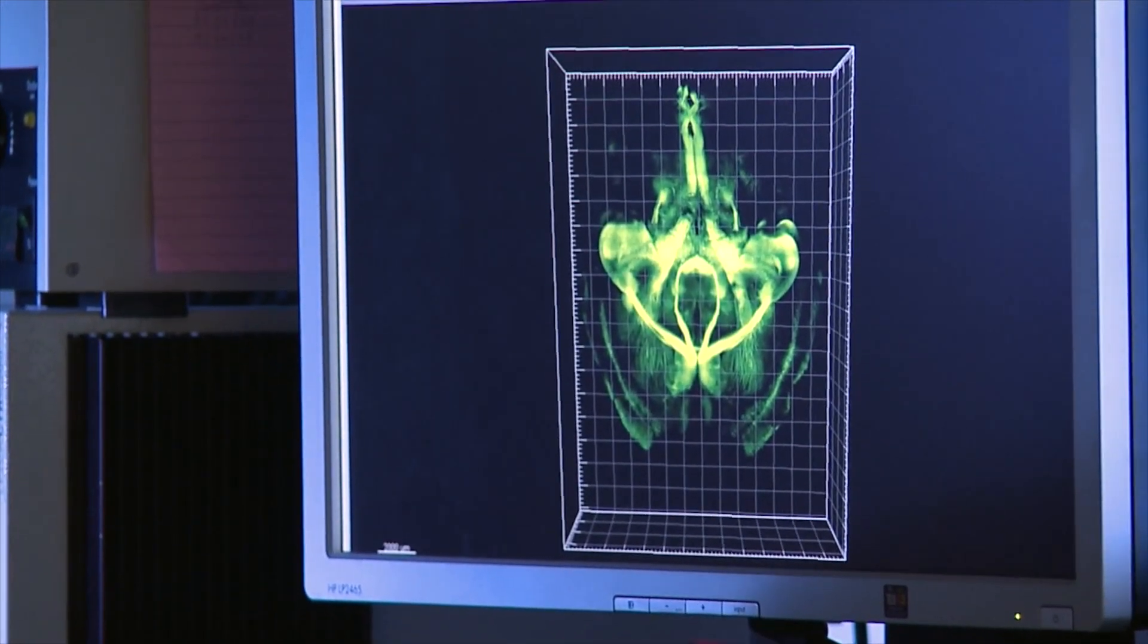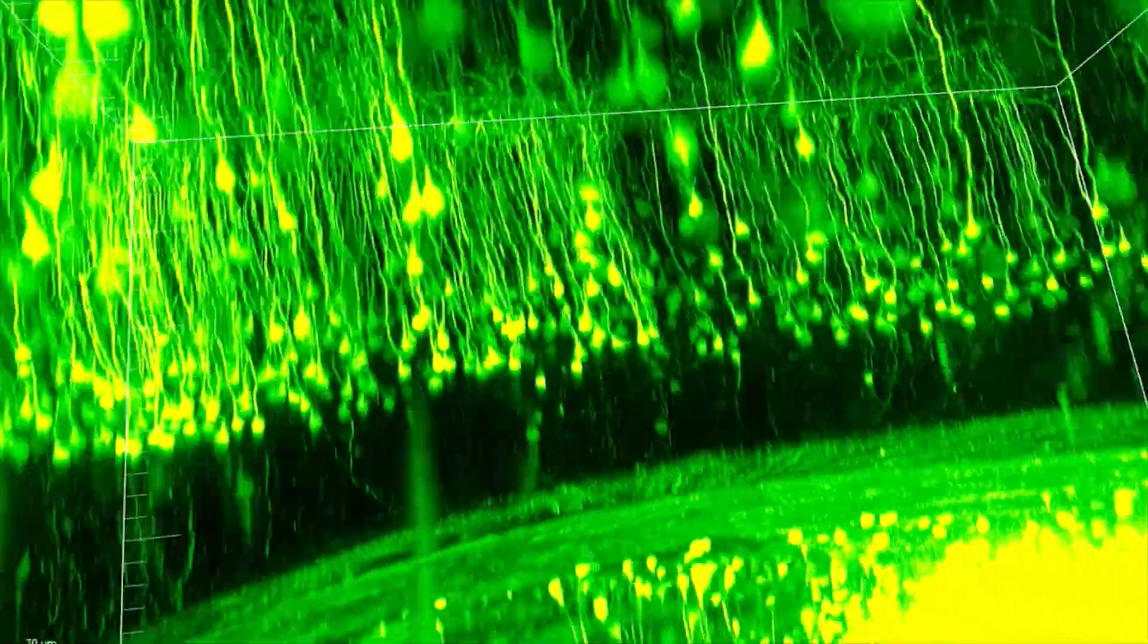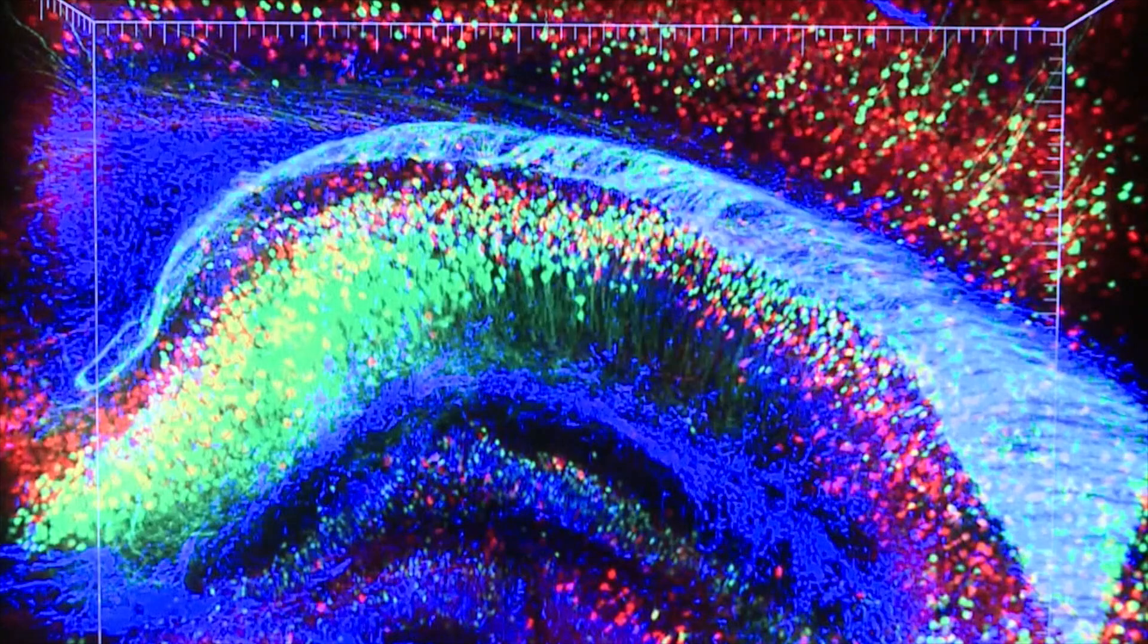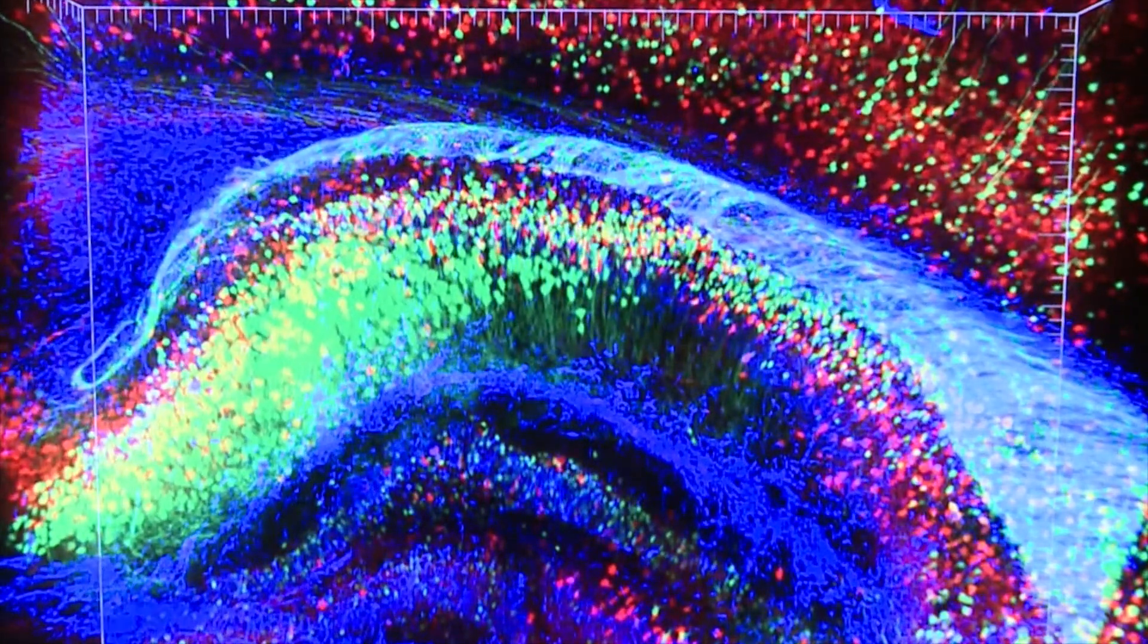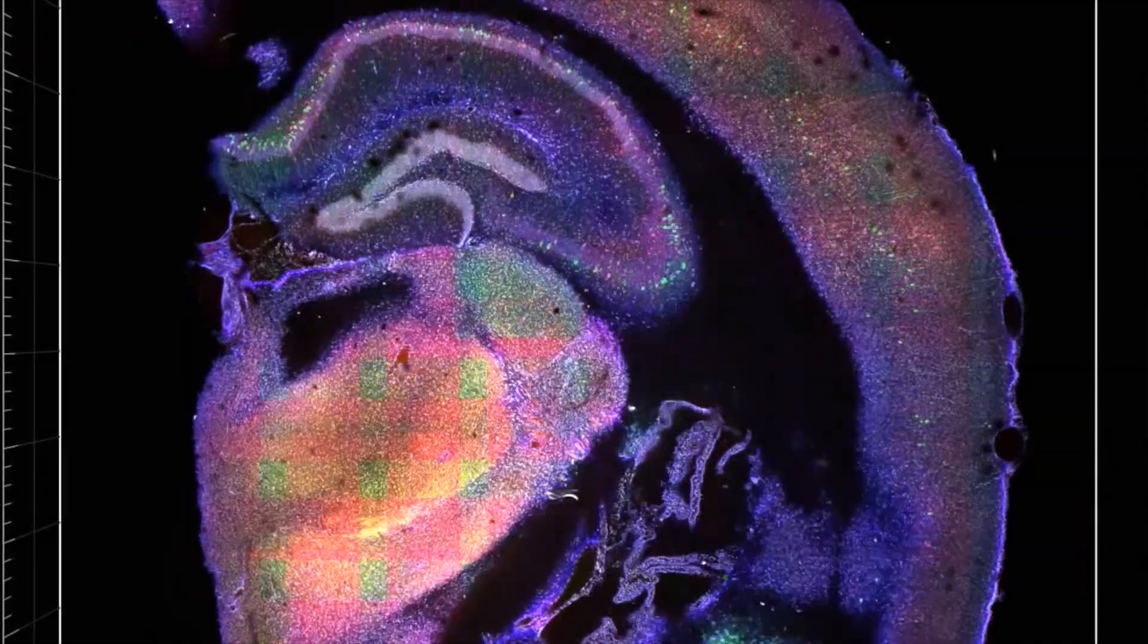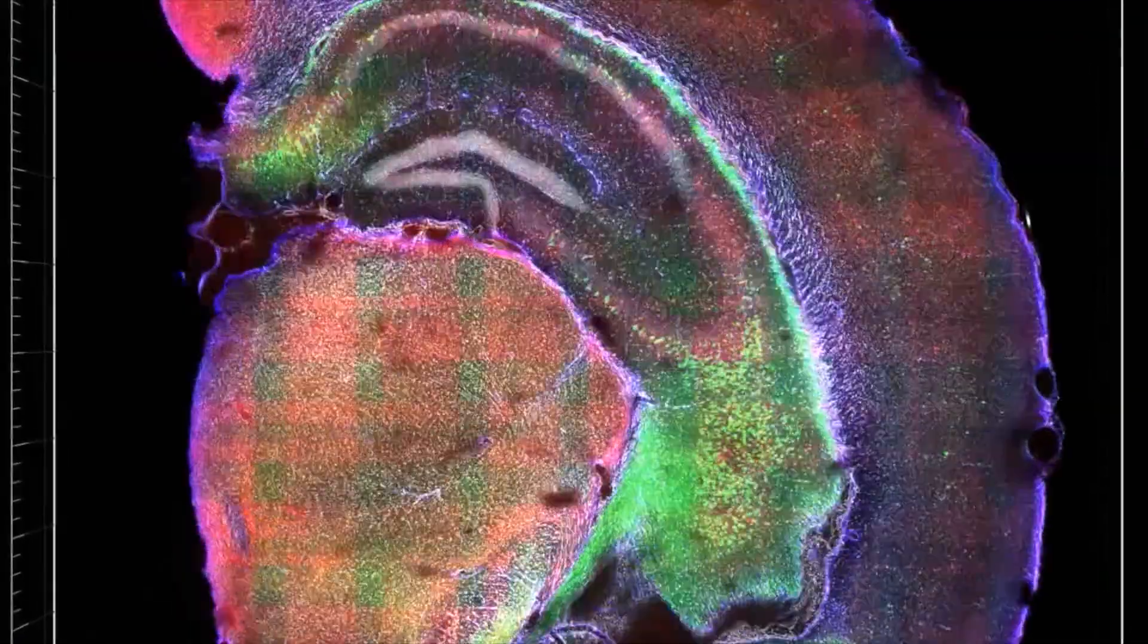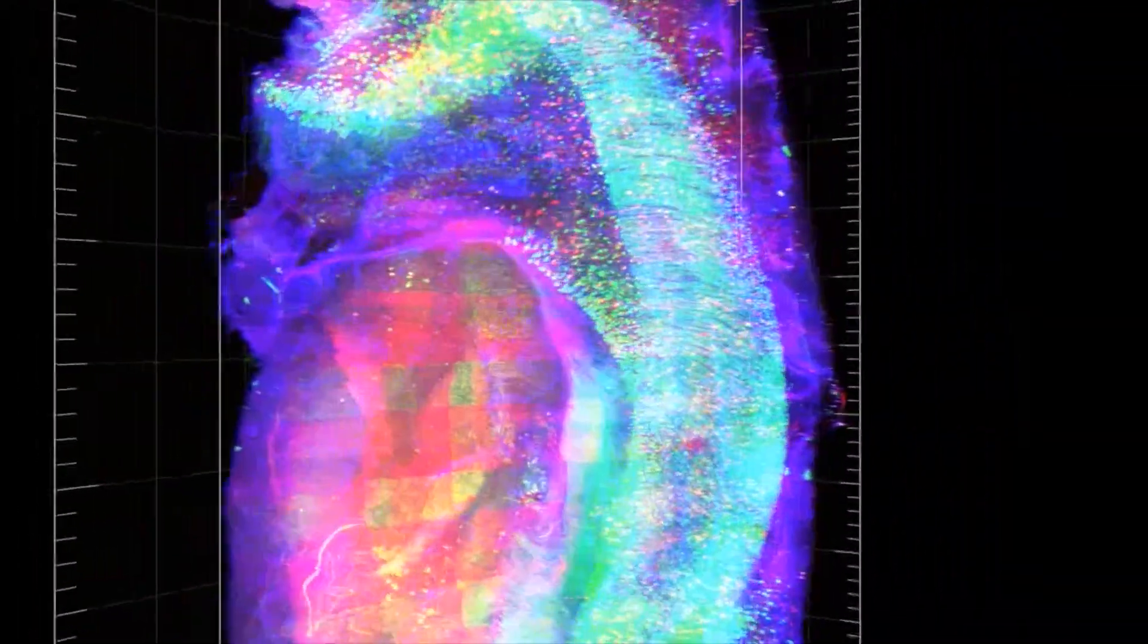So this is a whole mouse brain and we're going to fly in and look around. Where you see groups of greenish yellow spheres, those are individual neurons, and you can see how they're all arranged relative to each other. The different colors—the green, the red, and the blue—each of those are labels for a different kind of cell. Our goal is to understand the system in its entirety, but also at high resolution at the level of its wiring and the individual cells.